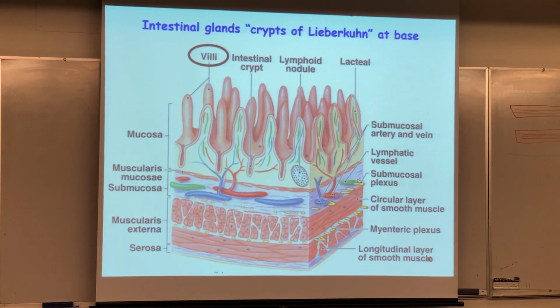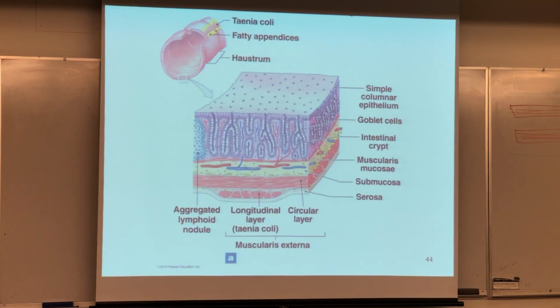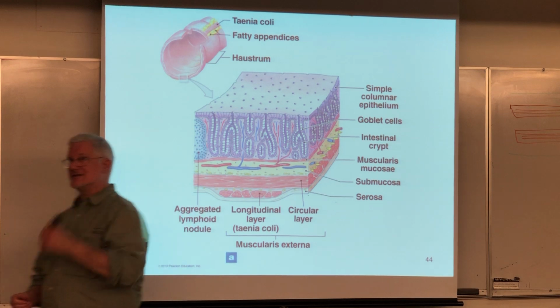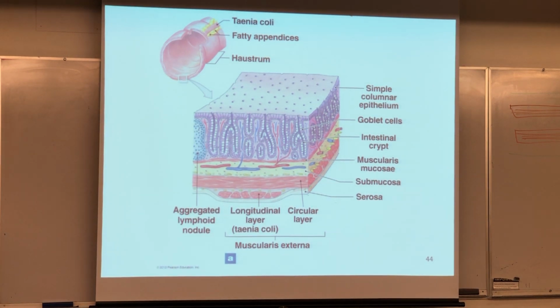All right. See all the nice little villi? Lots of surface area, small intestine, jejunum, lots of absorbing, plicae, microvilli, villi, and then you get here. Boring. No folds, no villi. So if you were an alien scientist and you started dissecting somebody and you came across this region in the intestines, you know automatically it doesn't do a whole lot of absorbing.